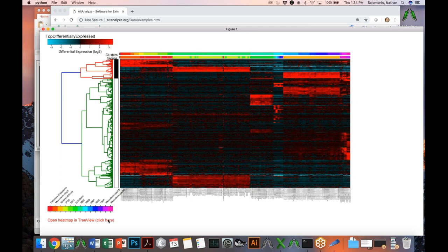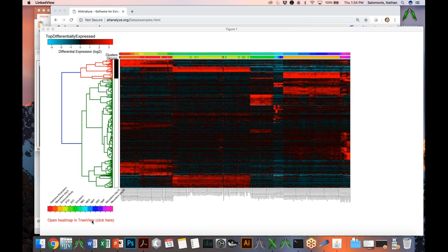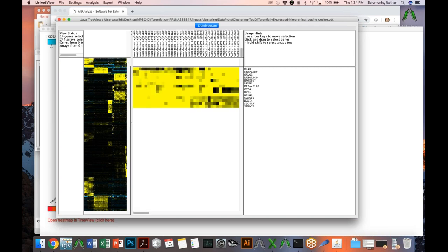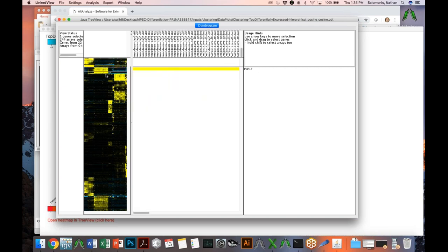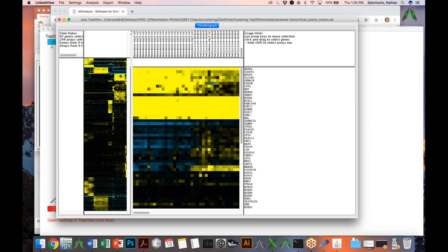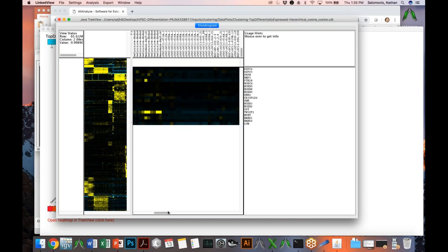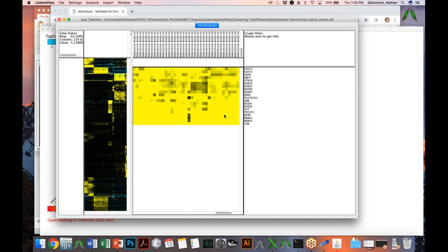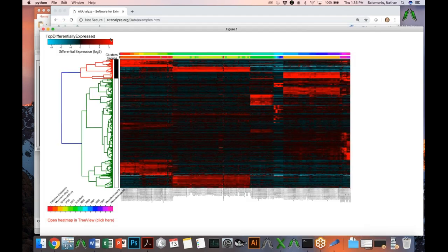Once you obtain a heat map, there's an option to open it in TreeView. AltAnalyze automatically comes with Java TreeView, previously described and developed by another group. You can interactively navigate the genes within this heat map. For example, looking at this cluster, scrolling over to see the gene names reveals it appears to be dominated by Hox genes — Hand1, Hand2. These happen to be embryoid body samples, and what we see is probably the induction of something analogous to a cardiac differentiation program within these cells.